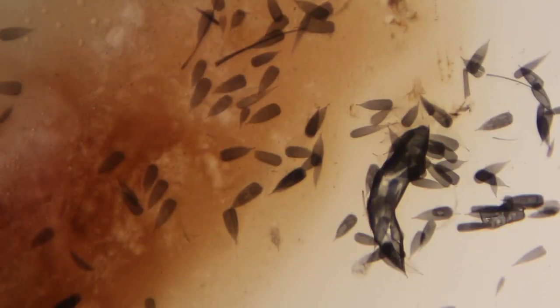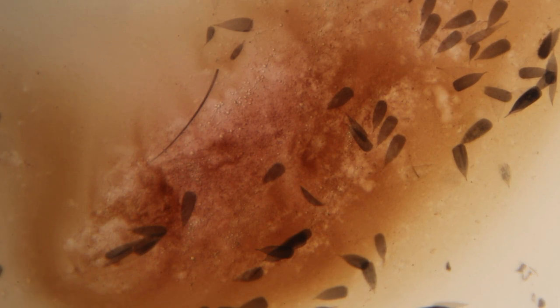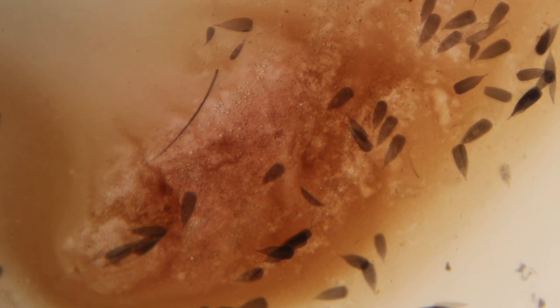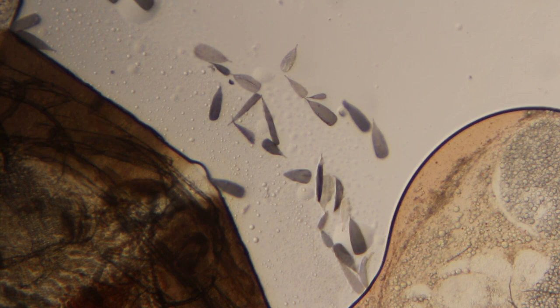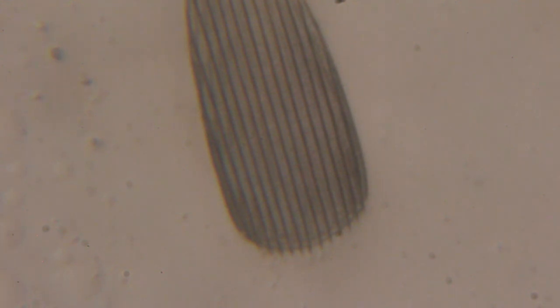As we zoom in, you can see the hemoglobin just drifting around outside of my blood cells. But wow, what are these things here? They almost look like feathers because they have a tapered tip. I can only assume that maybe these are the actual eggs that are developing inside of the mosquito. There's the abdomen on the left, and on the right you see the eggs. This is a real good magnification of these objects. Maybe somebody out there knows what they are. It'd be very interesting to confirm if these are in fact eggs.